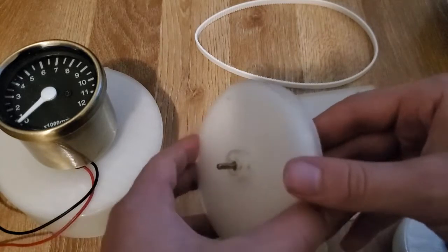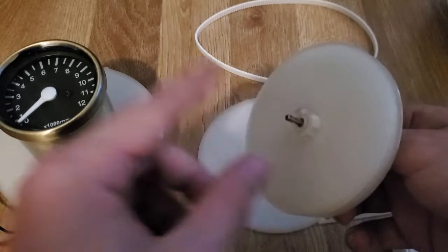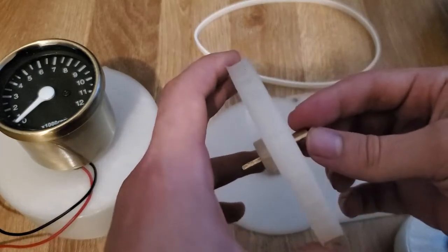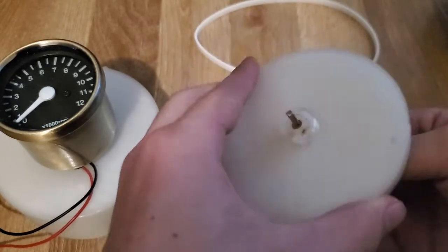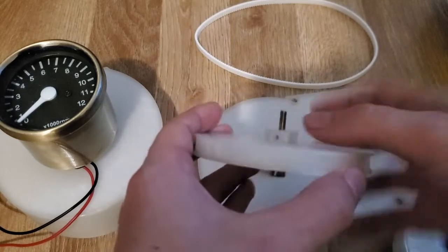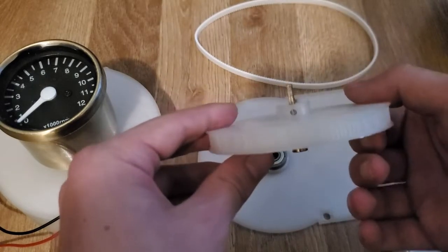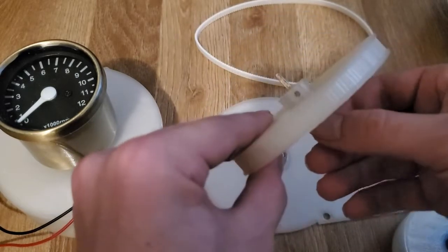The other interesting thing about this is I actually got the adapter for this. It needs a square key. I got it 3D printed in metal. I wanted to try out that process and see how it went, and yeah, it turned out quite well. I thought that maybe the printed part in plastic would snap here because you might have a lot of forces kind of sideways on that. But actually the plastic part worked quite well as well. So not totally necessary, but I got to see what metal 3D printed parts are like.